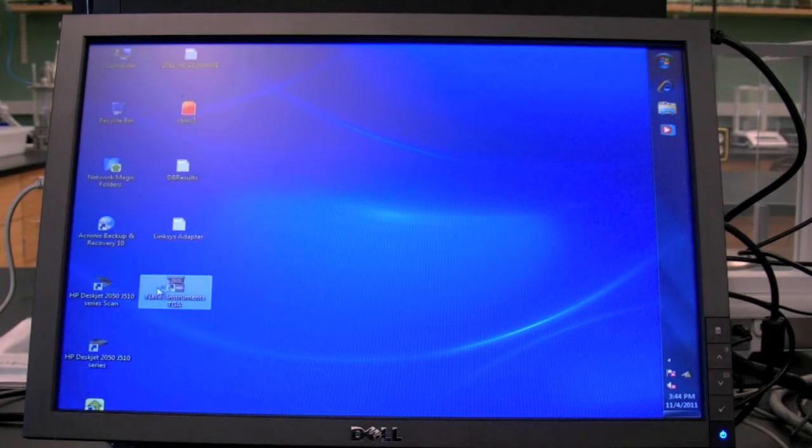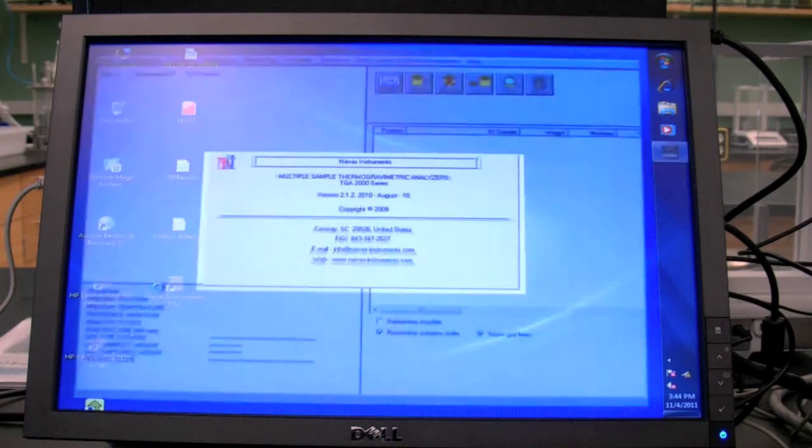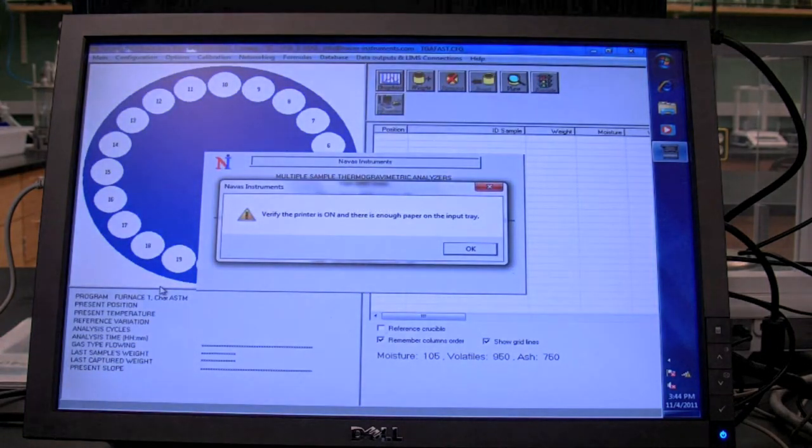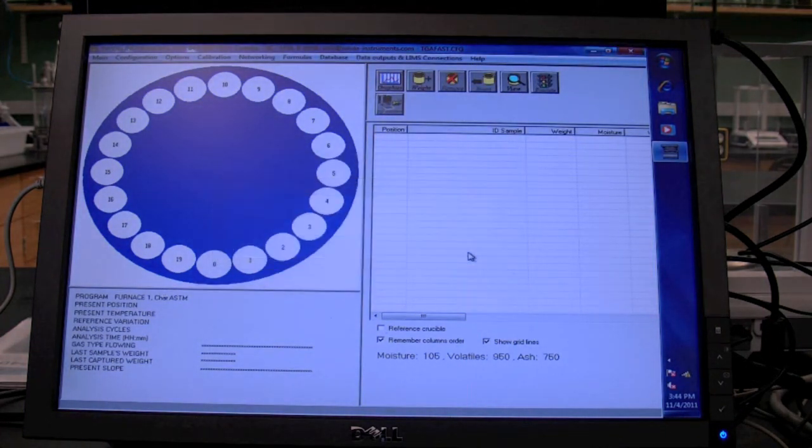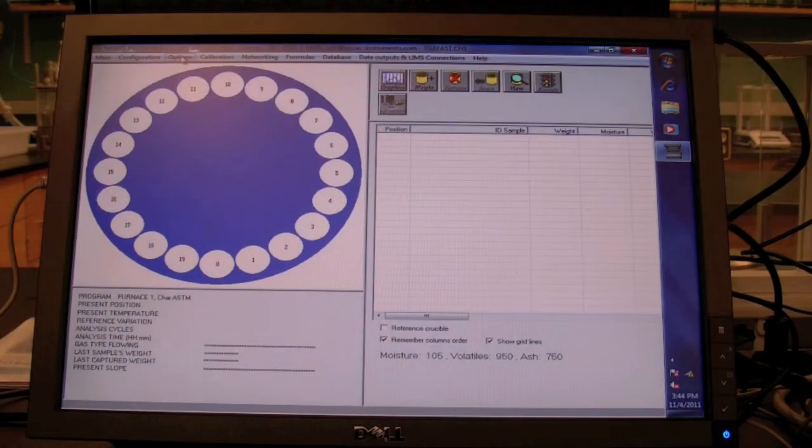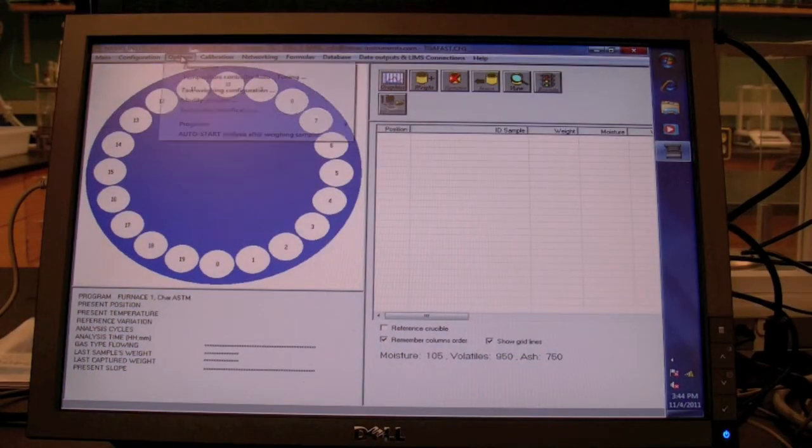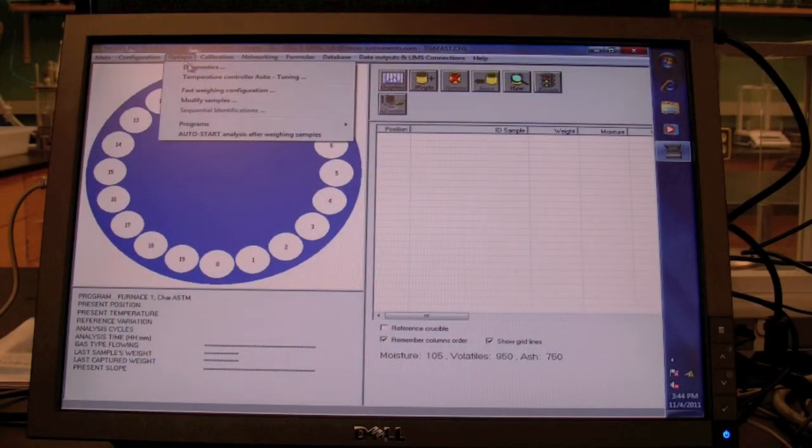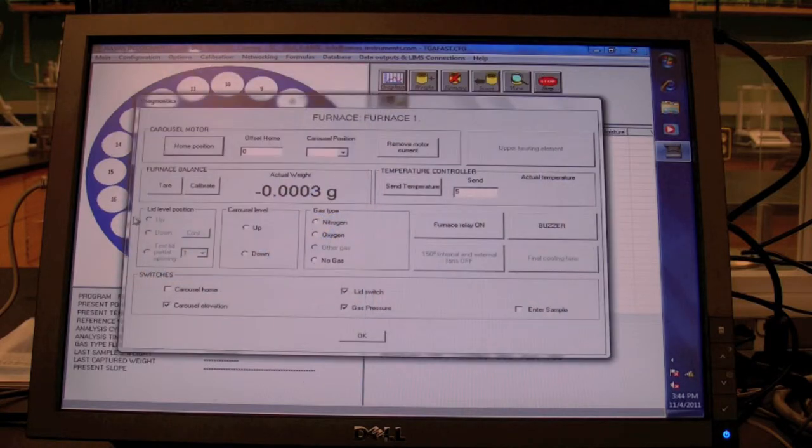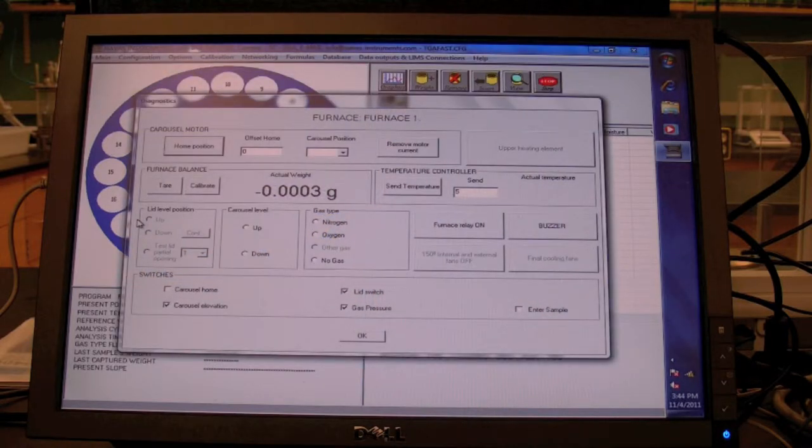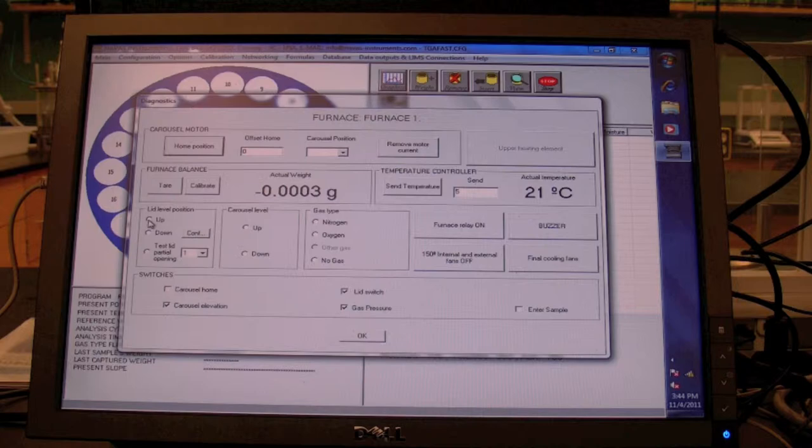Next, let's make sure the printer is on and has sufficient paper. Now that the instrument software is open, go to the options tab, down to diagnostics, wait for it to load, and hit up.